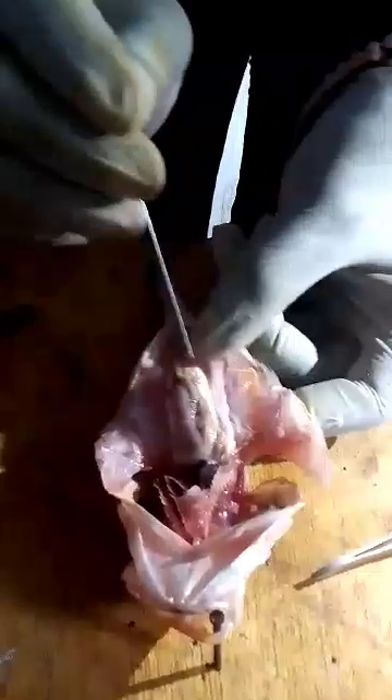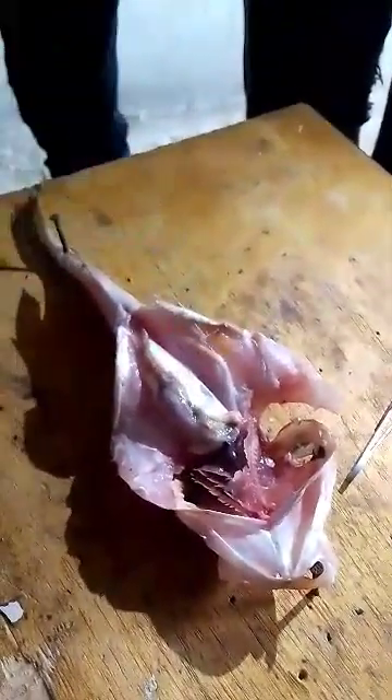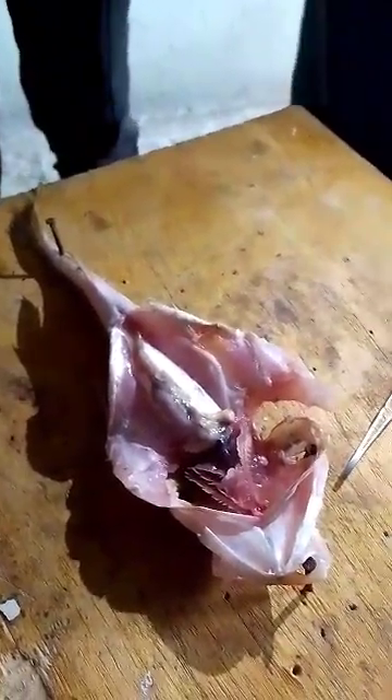When you first open your fish, the first thing to identify is this structure — the swim bladder. The swim bladder functions for buoyancy, like when you swim and put a small float on your hand so that you do not sink. The fish uses air trapped in the swim bladder to remain near the surface. When it wants to go deep, it removes the oxygen so it can sink deeper.